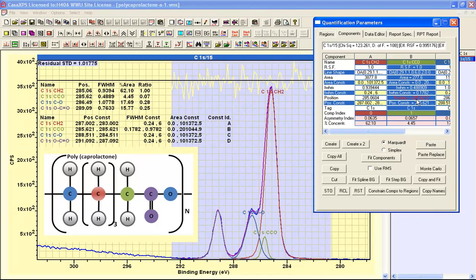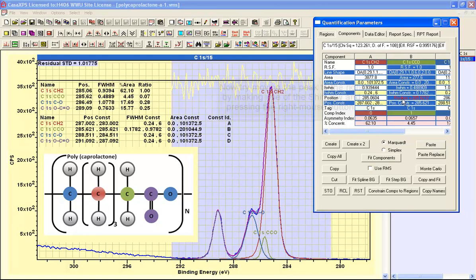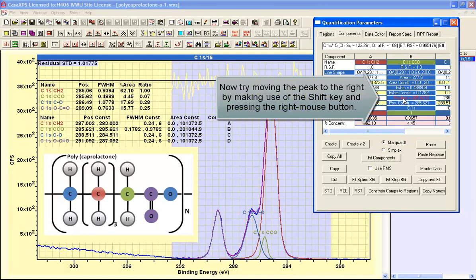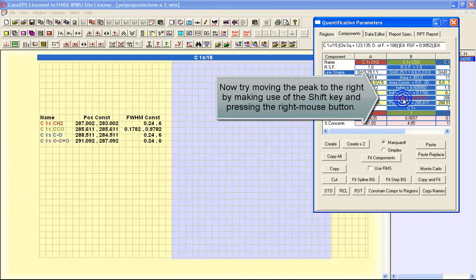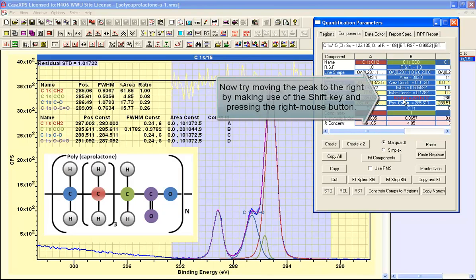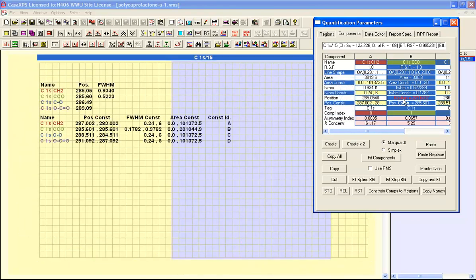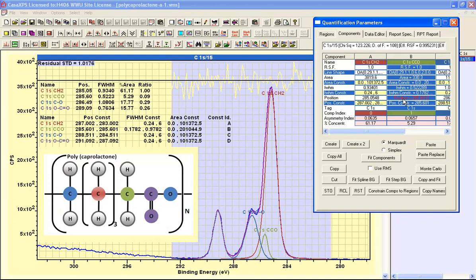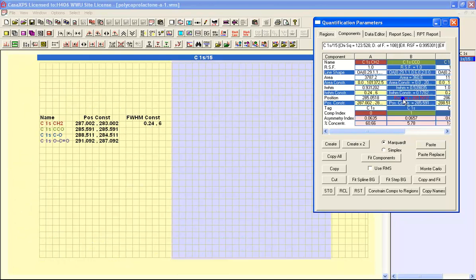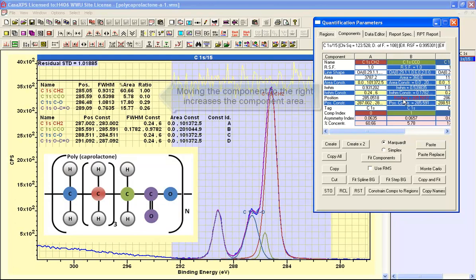And then the other peaks are refitted to produce a new residual standard deviation, and the size has changed. It's slightly smaller than it was initially. I'm going to right click, and this moves the peak position to the right. And each time the other peaks are refitted.